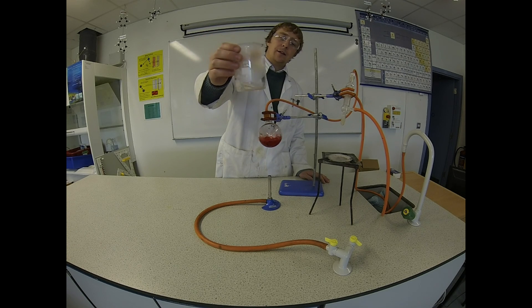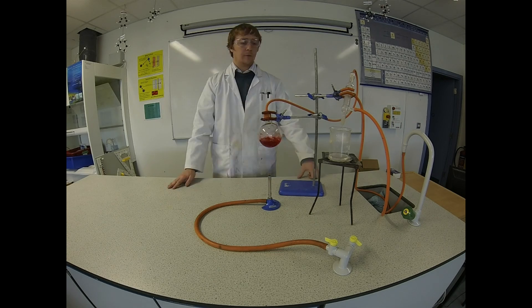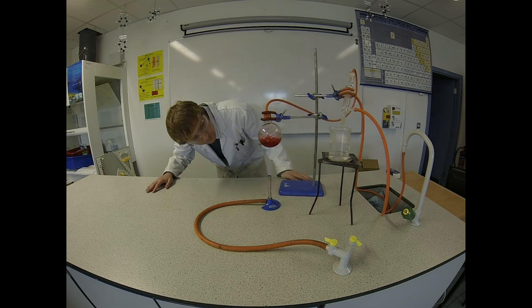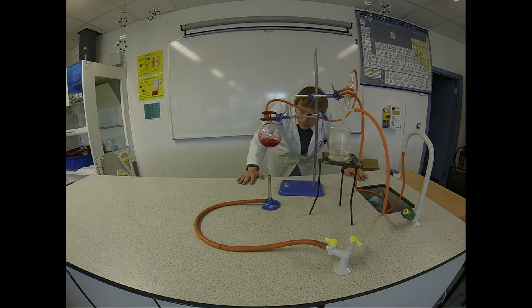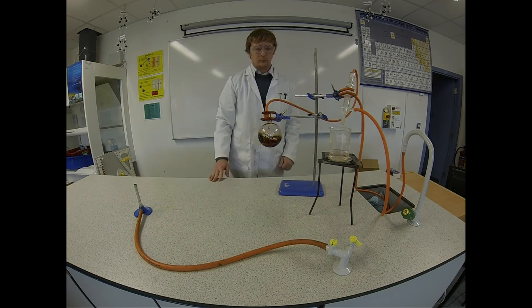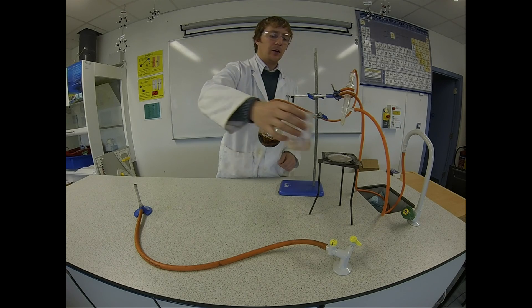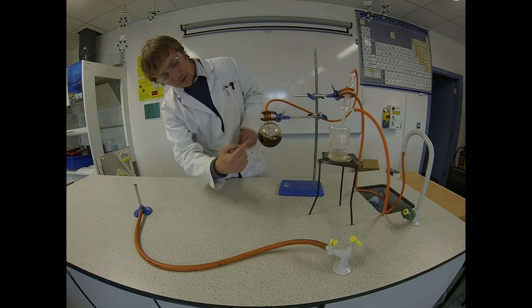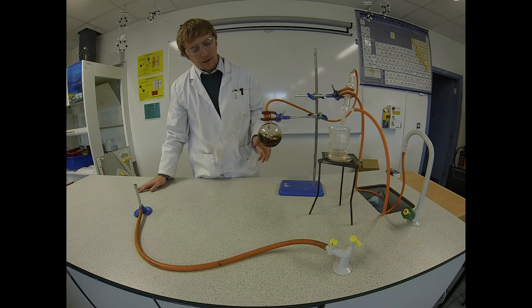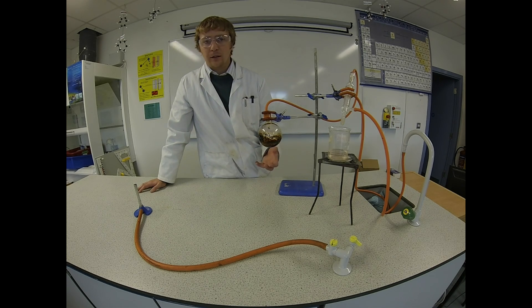A good bit of water has started to collect in the beaker. We'll keep going until we have all the water from the round bottom flask in the beaker. You can see the water — which the salt was dissolved in — has moved into the beaker through the Leibig condenser. Inside the round bottom flask you can see all the salt has now formed around the edges. It's a dark colour instead of white because it's mixed with the red food colouring, which I added to make the salt easier to see at the end.